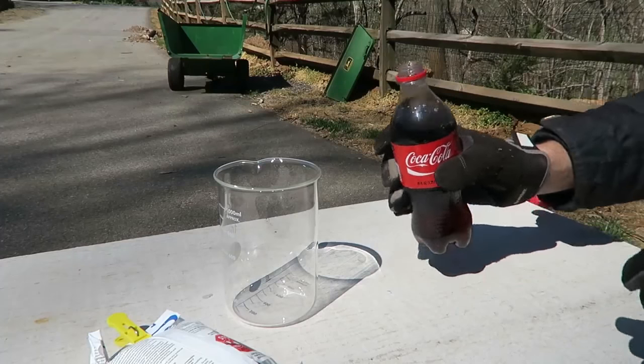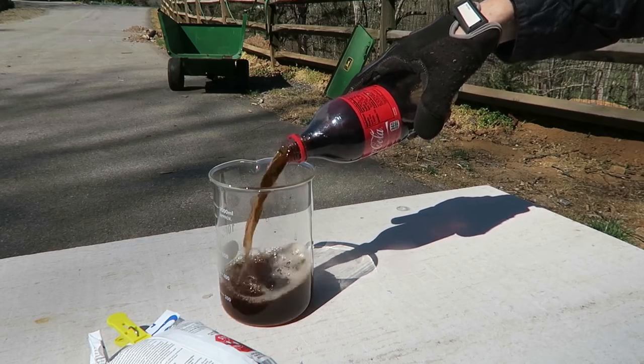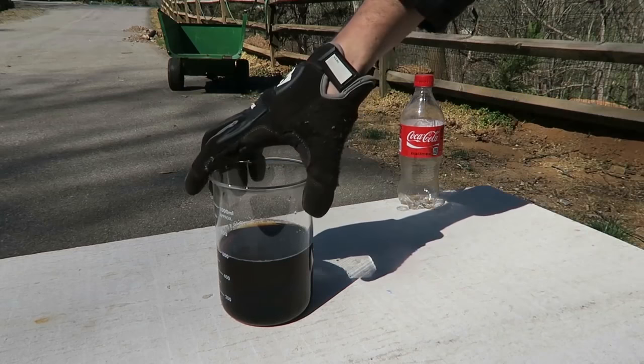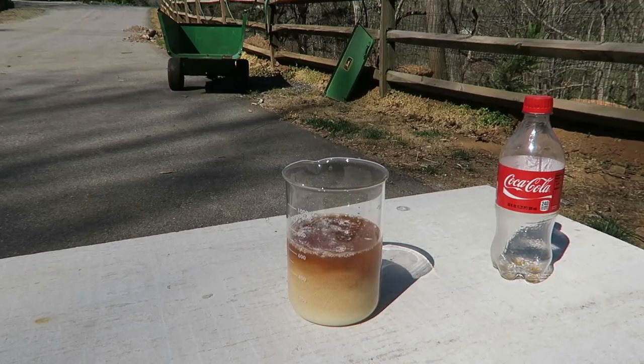We're going to open up a Coca-Cola and put it in a beaker — a whole half a liter. Then we're going to get pool chlorine and put it right inside of the beaker to see what happens. Let's wait a second until the reaction starts off.